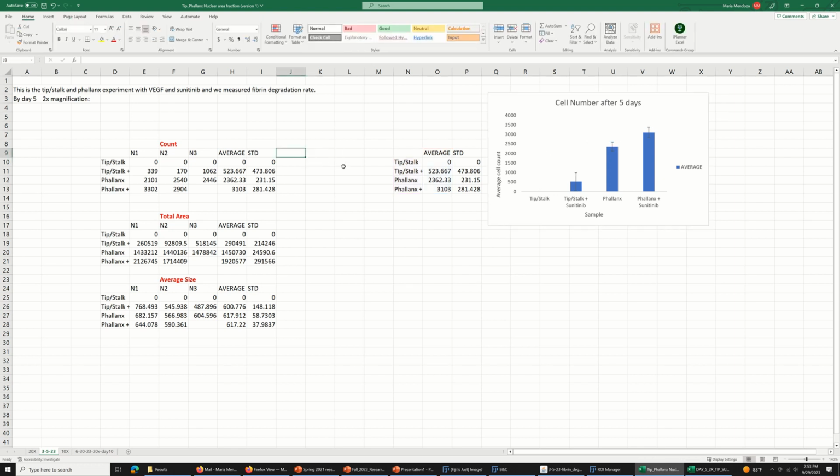So what we have to do is we have to perform an F test, and I'm still kind of learning how to do that, so I'm not going to do that in this video, and then we have to do our t-test. So I'm pretty sure that the f-test will tell you if your data is variable. So does it have high variability or not?